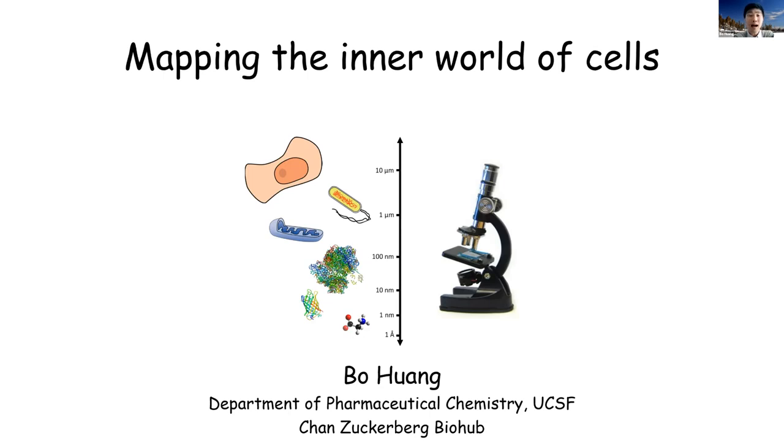As long as you're careful each round to pick the cells that are happy, most likely they can stay happy after multiple rounds of editing. Manuel has done a lot of knock-ins in iPS cells already. They're not friendly to cell culture, but they are really robust to CRISPR knock-in.